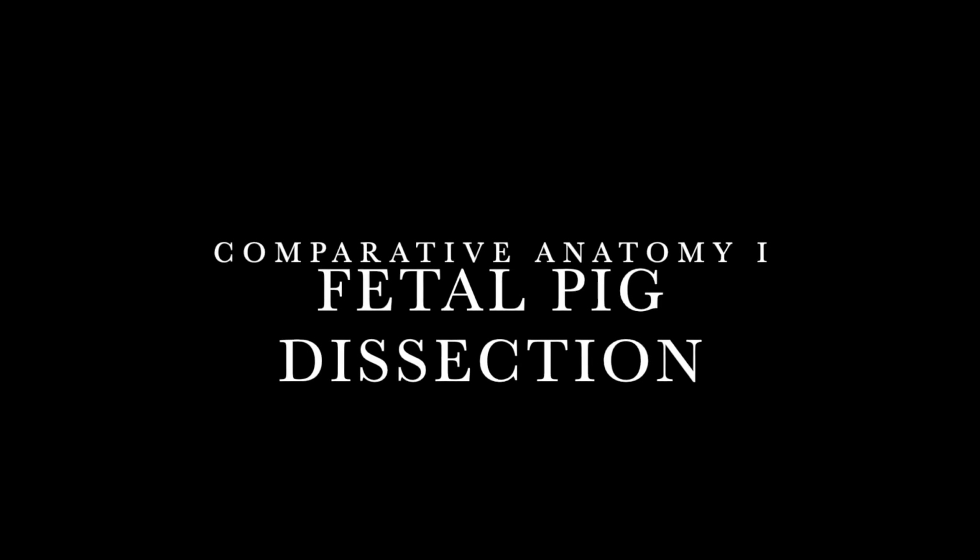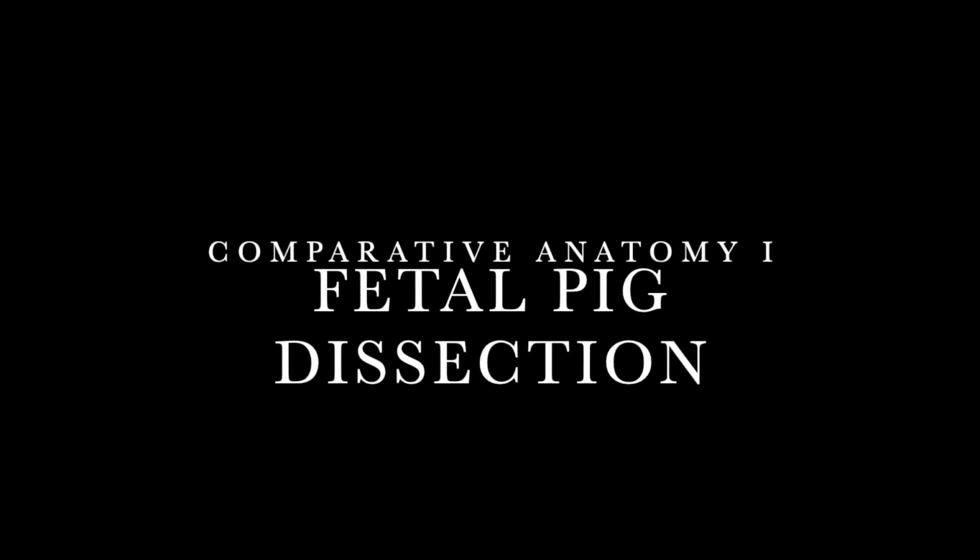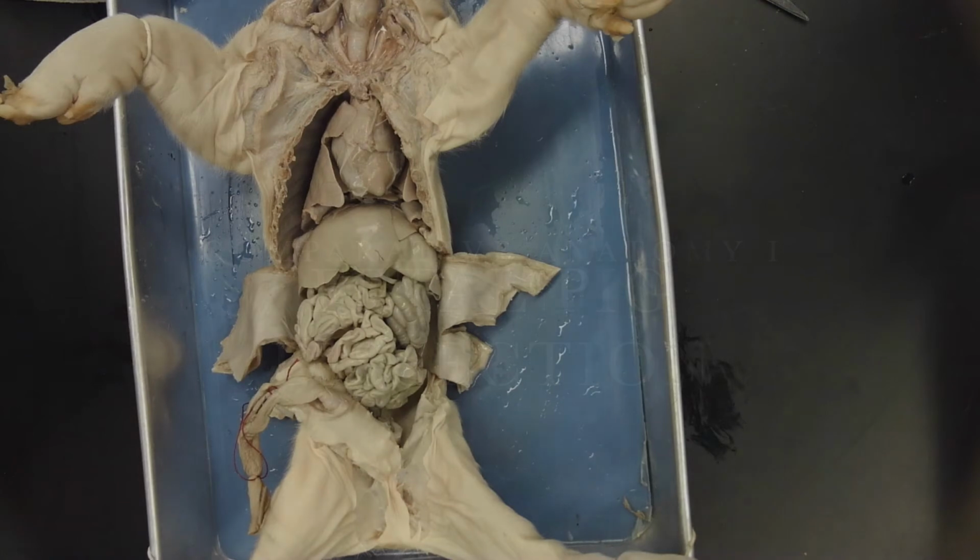Today we'll be dissecting a fetal pig to get a better look at the anatomy of its internal organs. Although this is a fetal pig that would have been receiving nutrients from the dam by the umbilicus, we're going to take a look at the digestive tract organs by tracing the path ingested materials would take through the body.